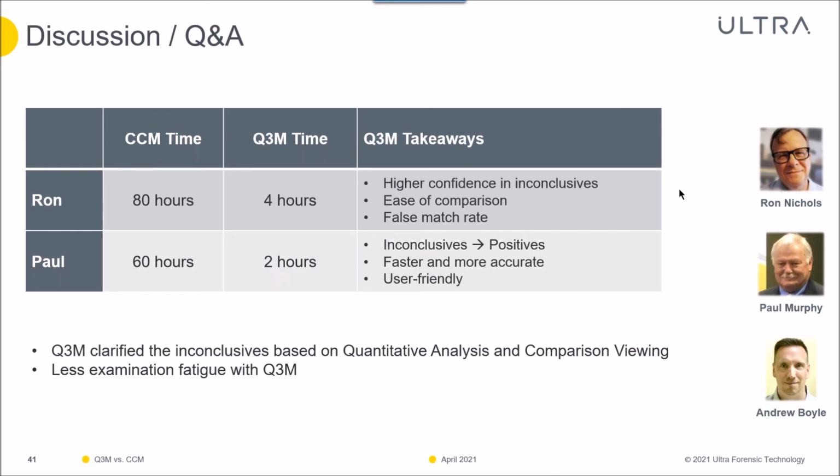And whatever is found, like a Google search from the IBIS system, will be brought into a microscope, either conventional or 3D microscopy as we go into the future. So no, although you see similarities in the side-by-side viewing capabilities of Matchpoint and the quantum 3D microscope, there is no intention of the two different purposes, the two different products, converging. I hope that answers your question.